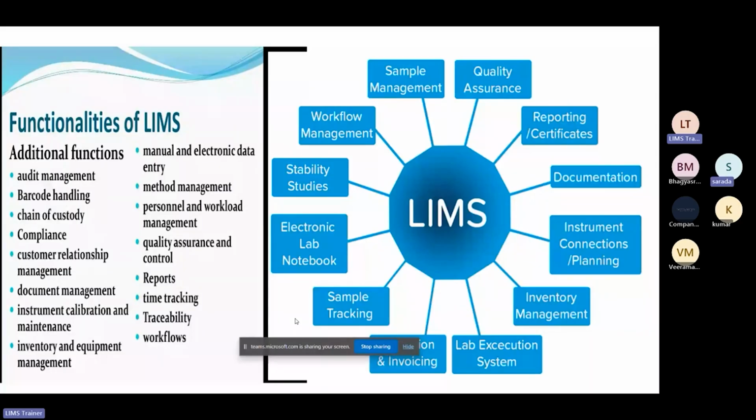All the reports are maintained. The time is tracked. All the activities are traceable. And the workflow also, as I have explained, the full workflow of LIMS is under control, and whatever activities are happening in LIMS are all traceable and controllable. Any questions here?